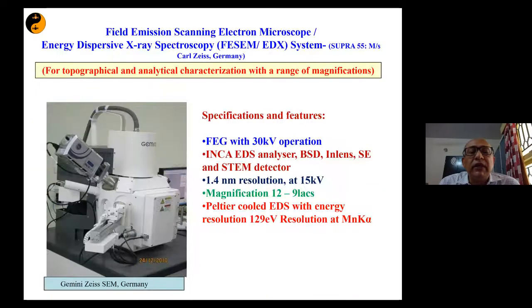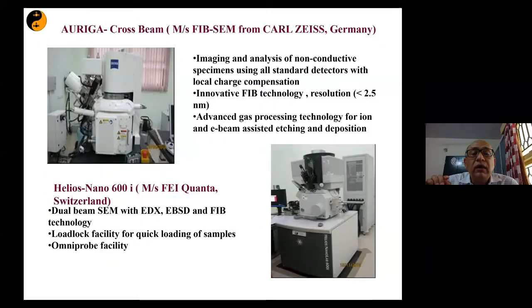This one is again FIB SEM, which has been widely used. I will be showing very nice results using this particular microscope. The nano patterning work which our colleagues have done, I will be showing you the results later. Just now I am listing all the facilities which are available in our center. So this is FIB SEM, and this is another one.